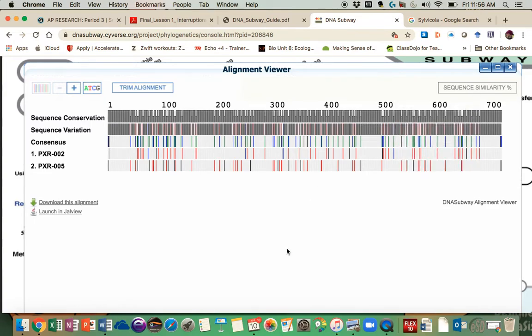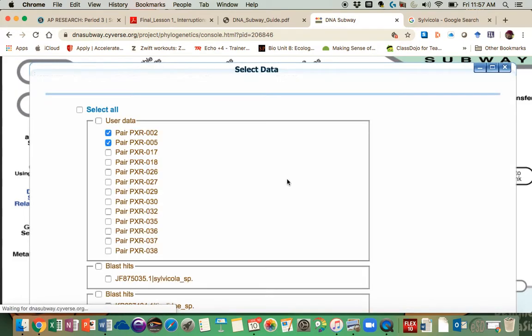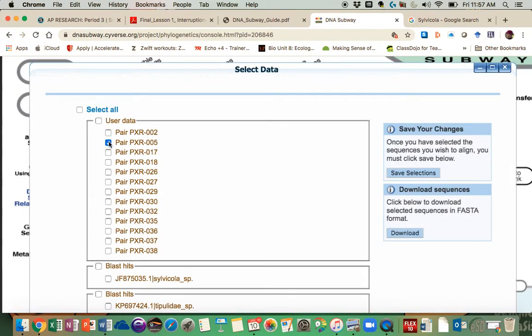I think it would make it more understandable for you to interpret the results as well as your reader in the paper in your results section. Okay, and then anytime you want to go back and switch that up, you can do that. So like we know that this is location 2, I believe, up to here. Pretty sure, right? Jules, I think this was yours.